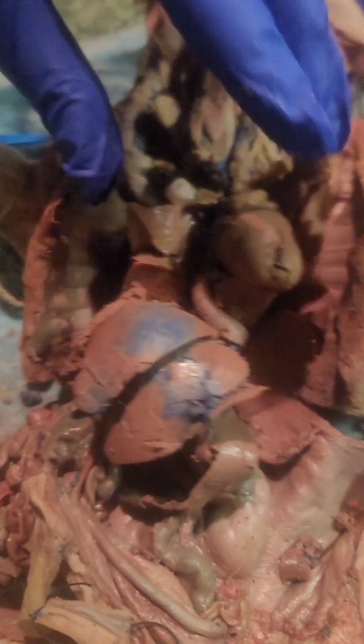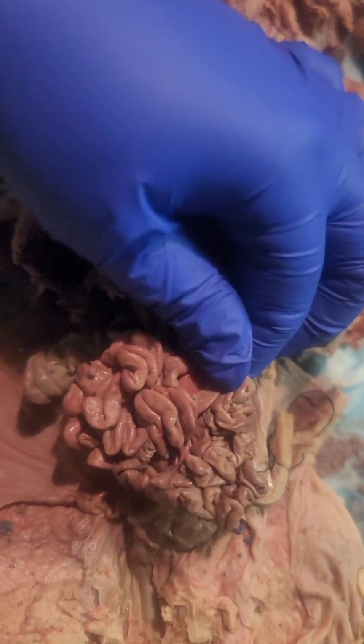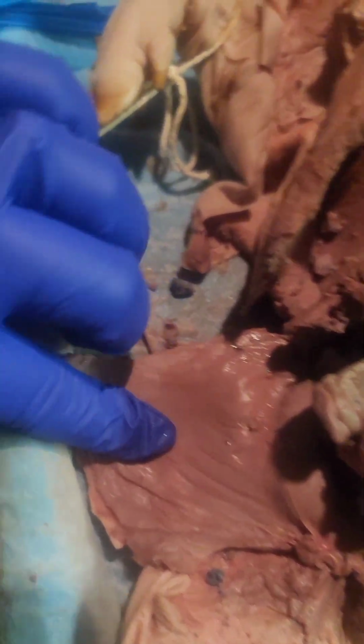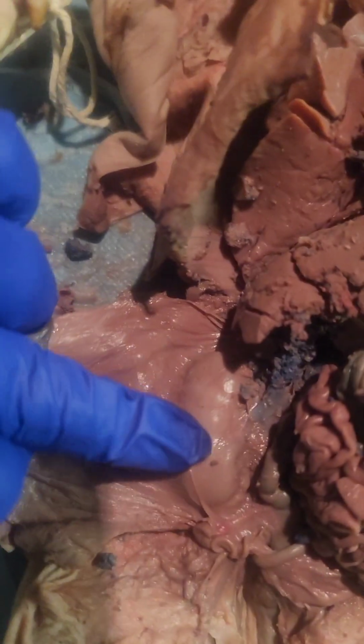Okay, the visceral peritoneum is basically on the surface of all of the organs here. It's just a very thin coating that you can kind of see is shiny. And the parietal peritoneum is still stuck to the outside of my kidney here.